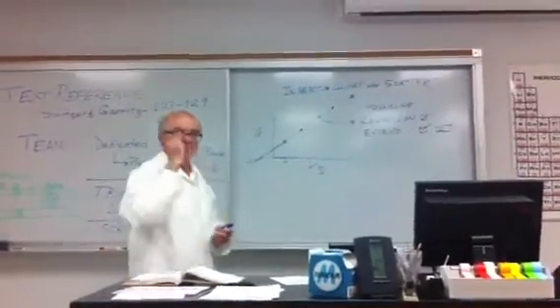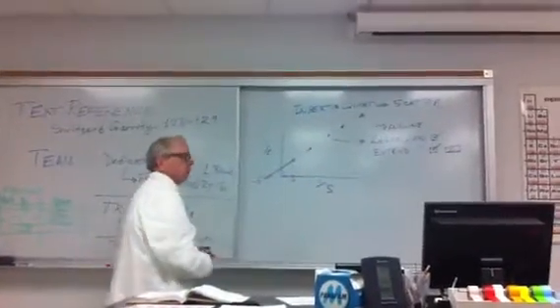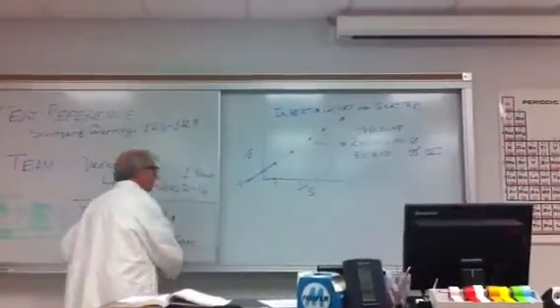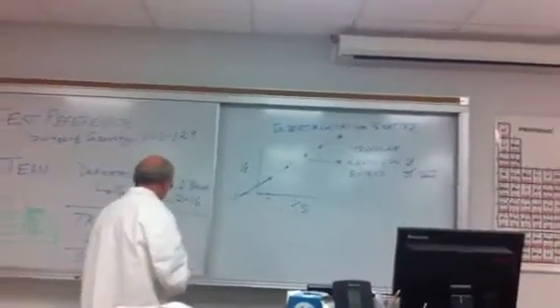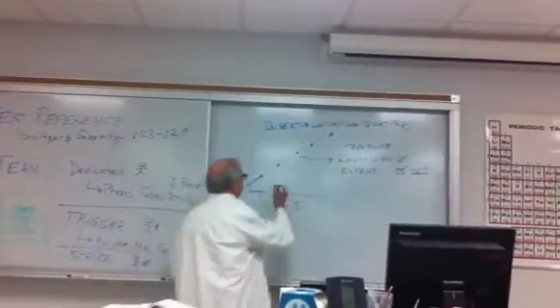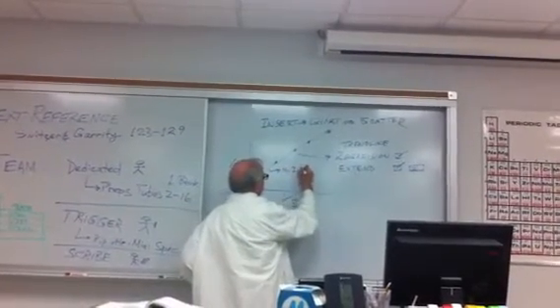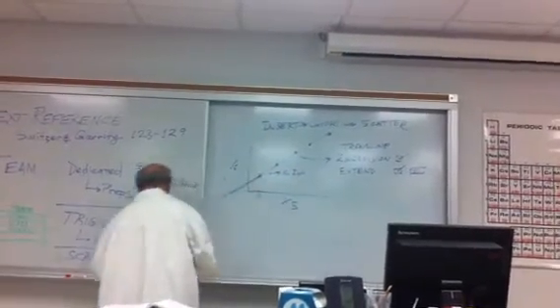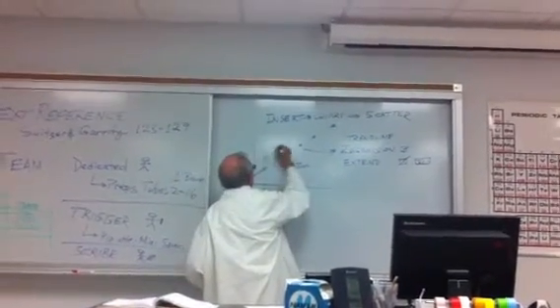So you mean you want us to extend the x-axis to the negative values? Negative direction. Okay. That's exactly right. You will get 3 graphs on one. You get 3. That was no inhibitor. Here it is. That's no inhibitor. Fine. Then you'll get one with an inhibitor. That's one of the inhibitors.